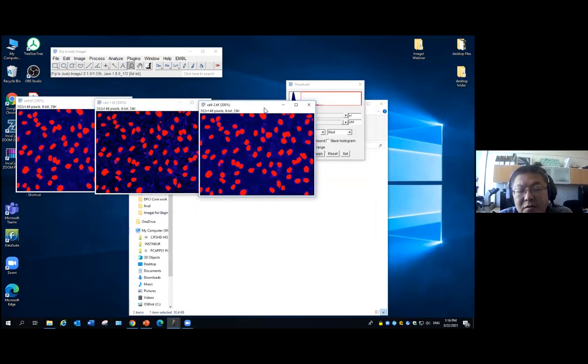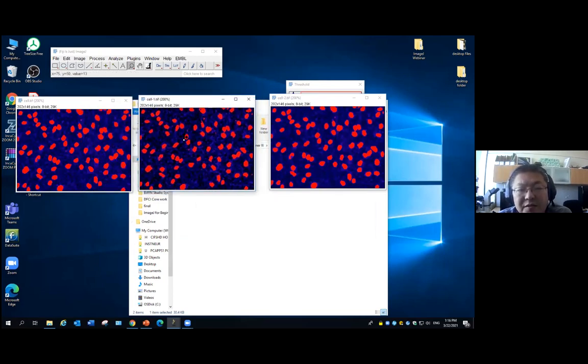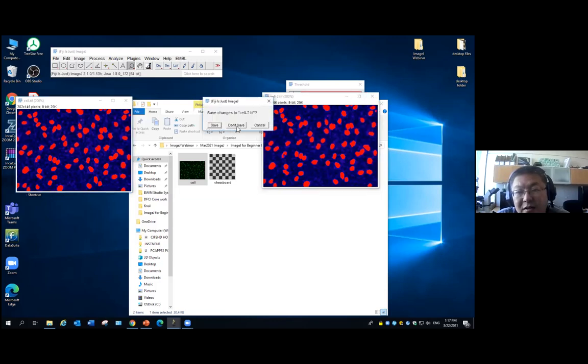So if I combine all this together, this one I use the mean filter, radius 1. This is a median filter, radius 1. This is a Gaussian blur filter with the radius of 1 pixel. So your goal is to go through your data, try to see what smoothing filters work the best and what radius choice works the best. It's a mean filter, radius 2 pixel, 1 pixel, I think. In this case, I will just use this one. I think the mean filter radius 1 works fine.